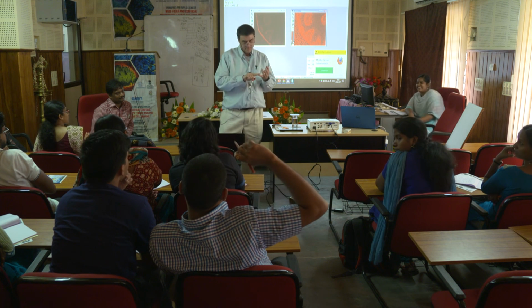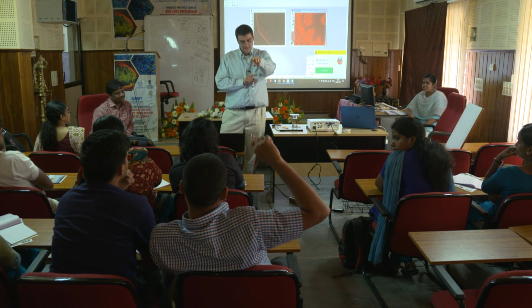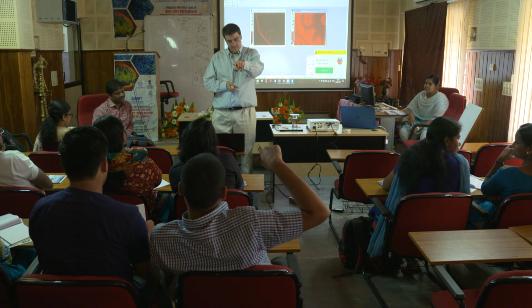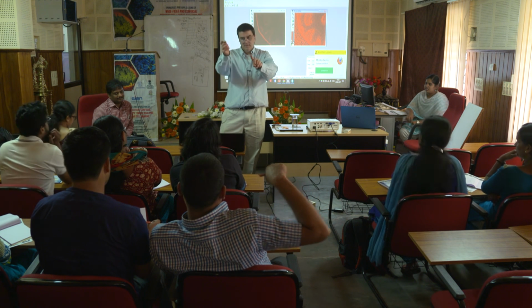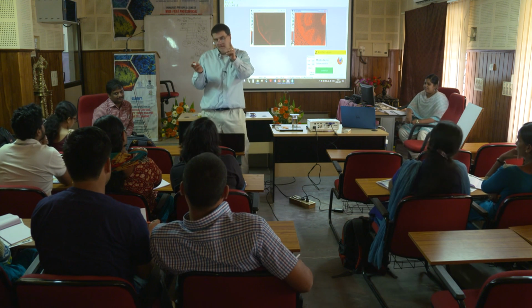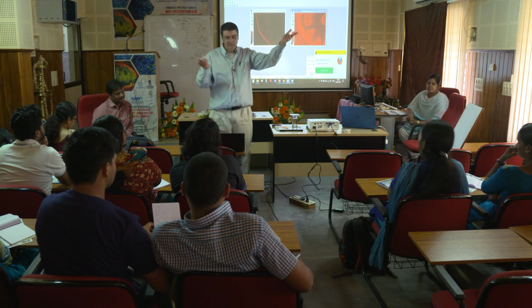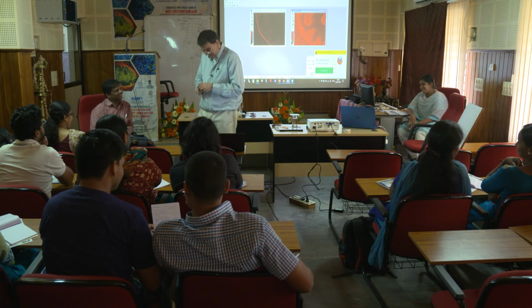Antibody dye, that's one. Well, not fluorescent microscopy, but fluorescent dye. Well, that's antibody, but fluorescent GFP. And then what's the other one? I think you said it through dye, right?